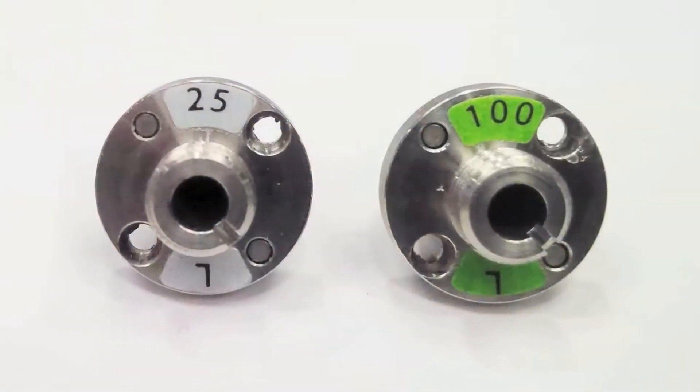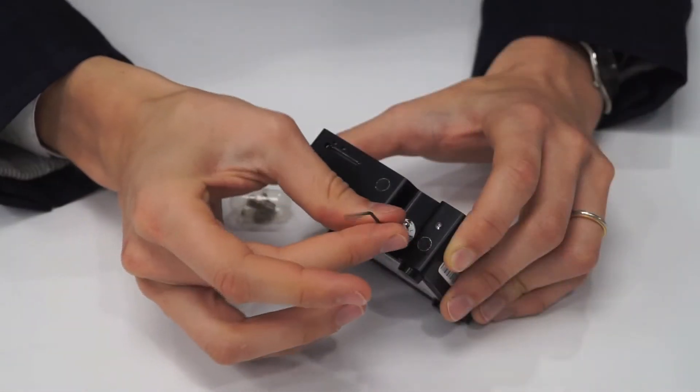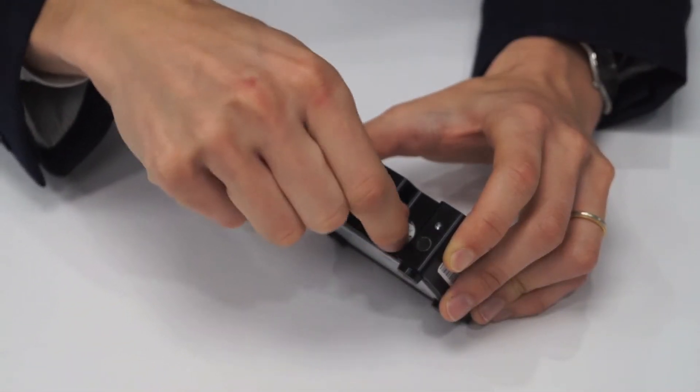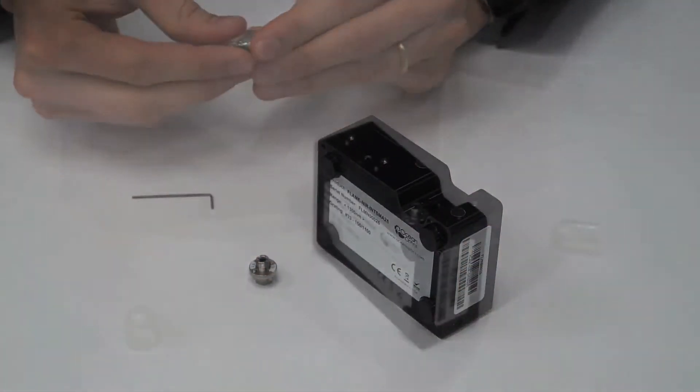With the interchangeable slit feature, you can vary the resolution and throughput on demand. By selecting a smaller slit you can improve resolution, while choosing a larger slit allows you to improve light throughput and sensitivity.